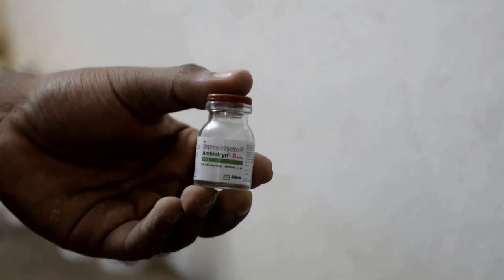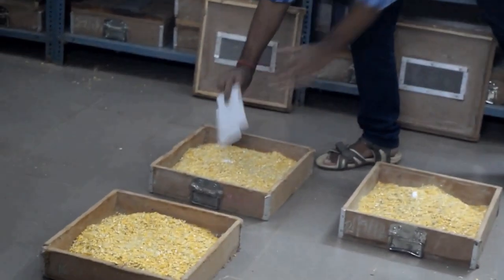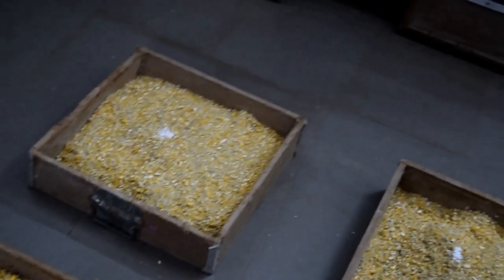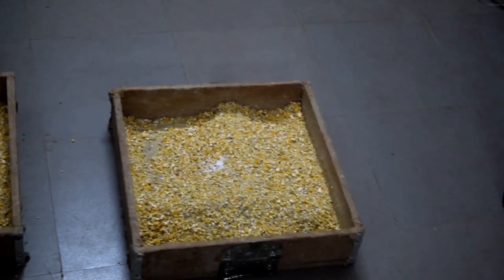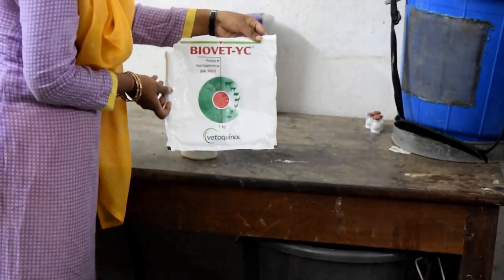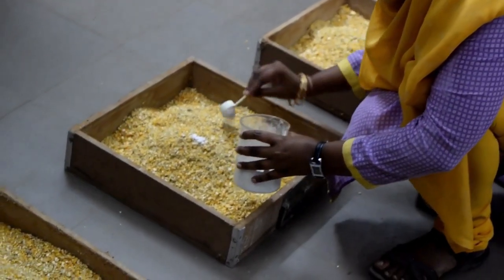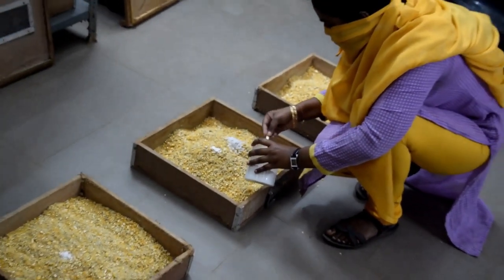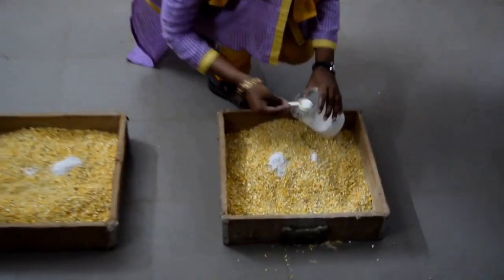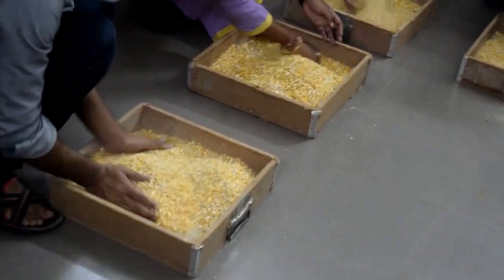Gram of streptomycin sulfate is added in the box as antibiotic. Gram of yeast powder is added as food supplement to increase the size and egg-laying capacity of the rice moths. These are thoroughly mixed with crushed maize grain and the surface is leveled.